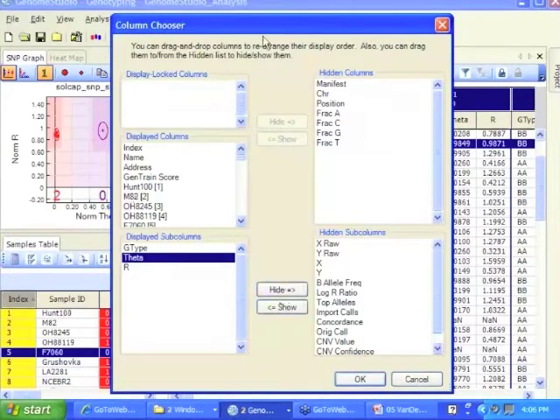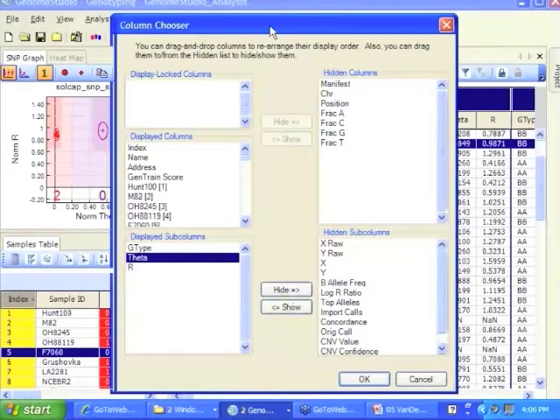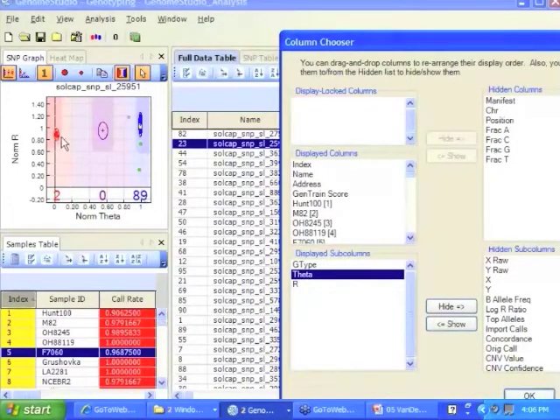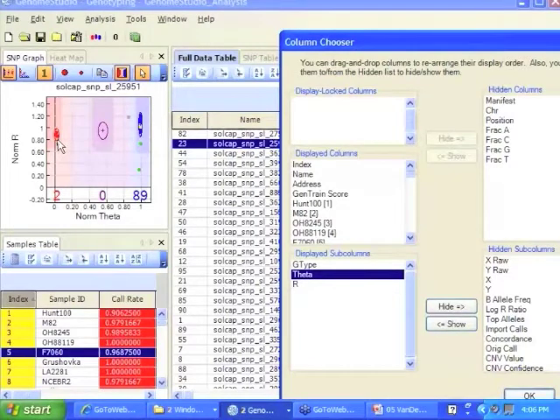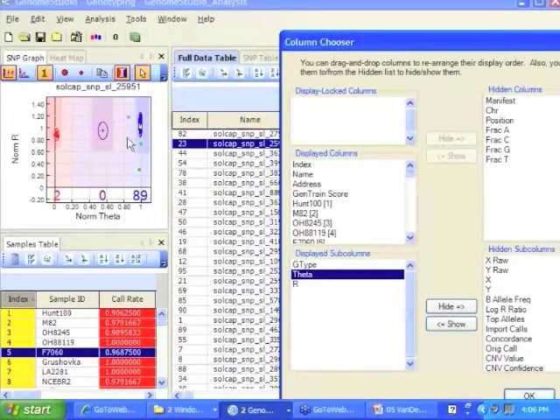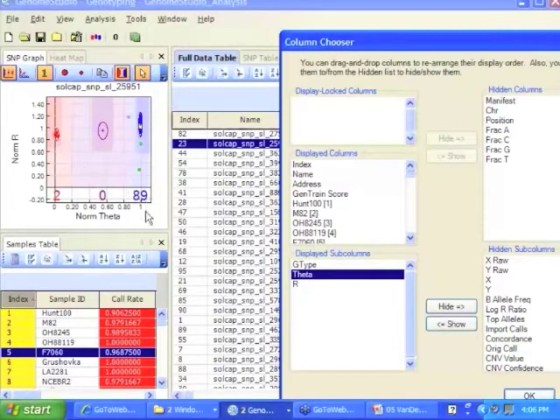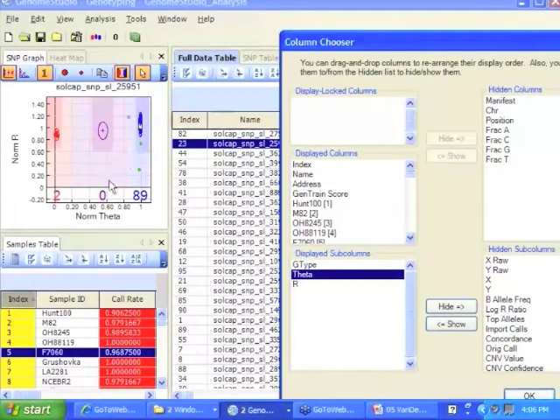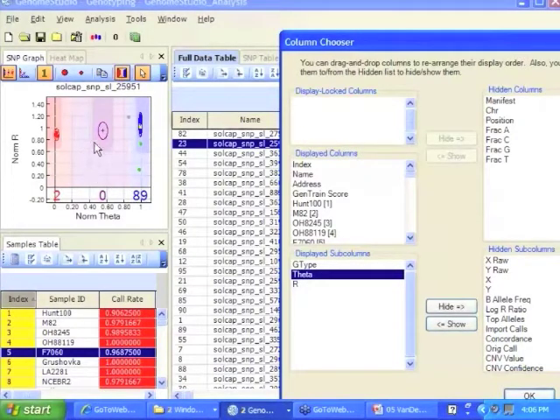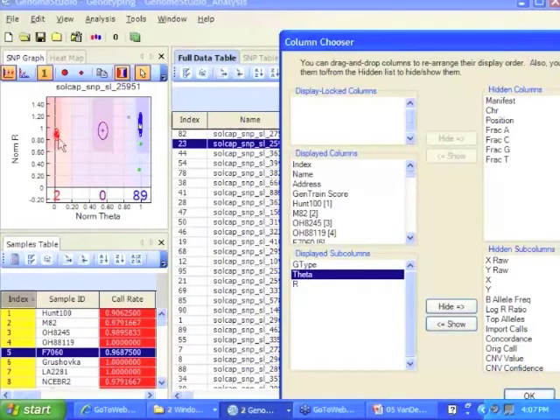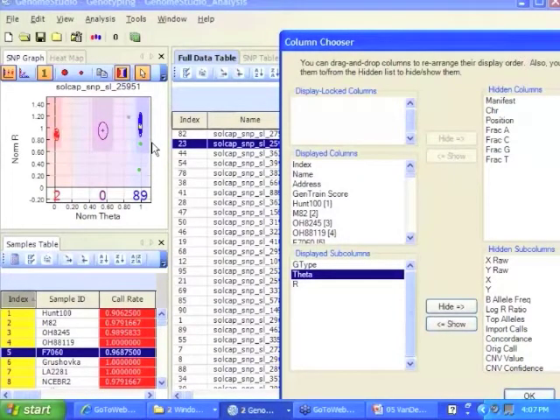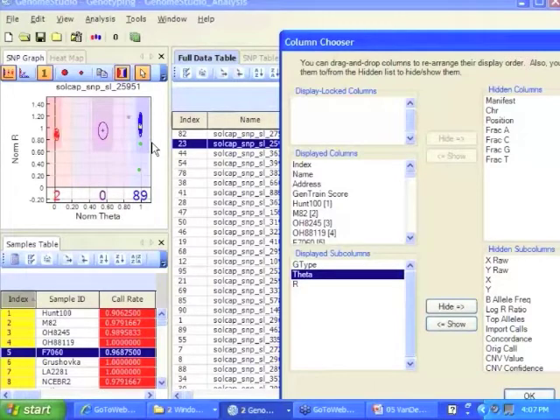Theta, the theta is actually, this is theta, this is basically where on this linear range does my sample fall. This is a theta of zero, this is a theta of one over here, so everything is between zero and one on that. So it gives you an idea of where on this linear axis your sample falls. It's really, it's directly related to percent green versus red.